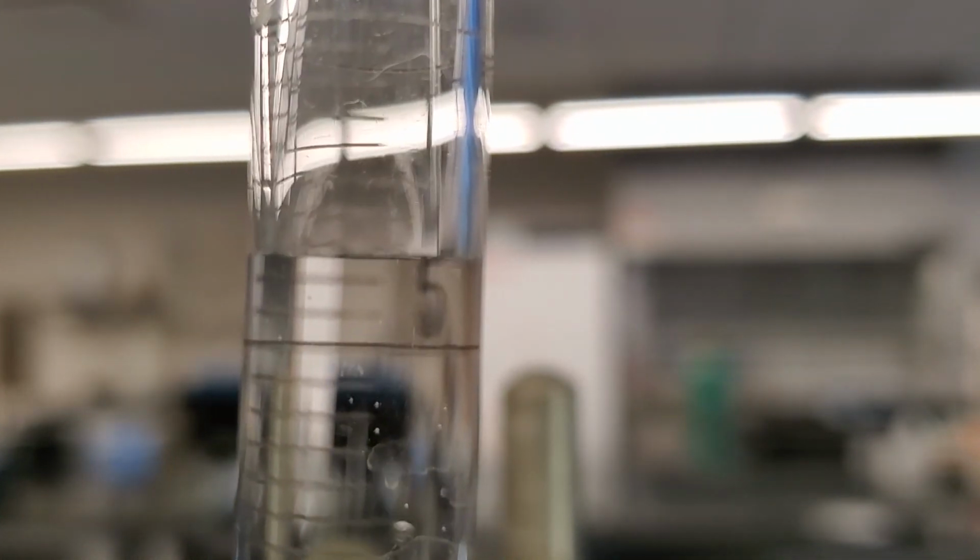At the beginning, I had the liquid right here at 0 point, and now the liquid layer is about 2 units above 5 or 3 units above 5. I would call it 4.7.